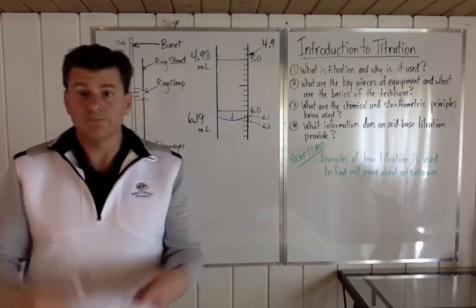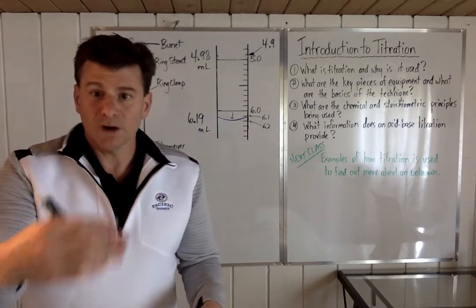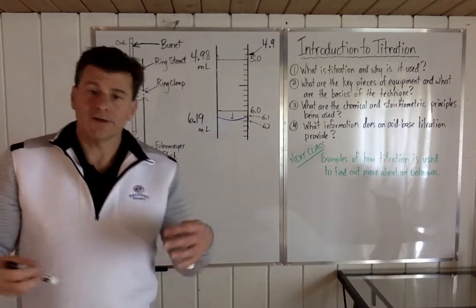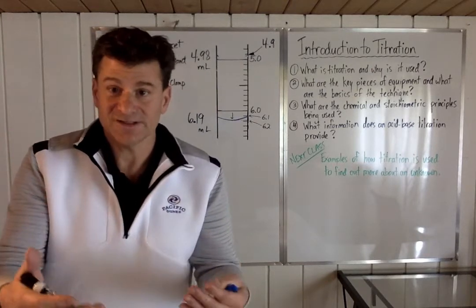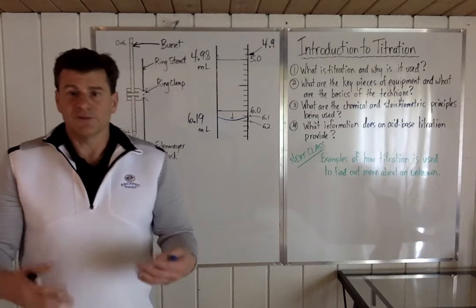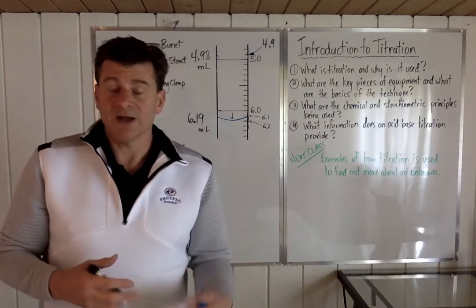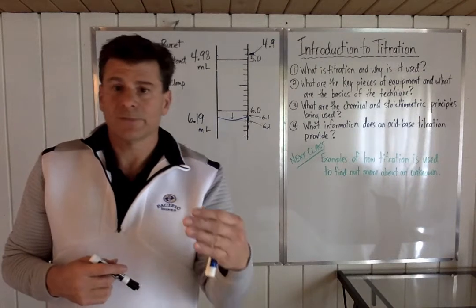Who's right? Me, because I'm the teacher? No. It is you, the observer. And so you are observing what the uncertain digit is. Now, there is obviously some degree of uncertainty in terms of the observer as well. So the more skilled and practiced you are, probably you've seen a few more things. But whatever, your eyes can work as good as mine. So your guesstimate is as good as mine, okay?